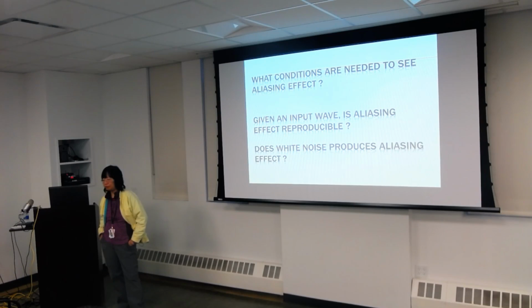In this case, the constant noise you're talking about is in real space, so you can subtract that in real space. But if any aliasing happens in Fourier space, it's still going to be there. You can't subtract that if it happens. But from what I understand, aliasing is essentially what happens when you do the transformation and your mathematical function doesn't describe your real data well enough, right? If the white noise is already subtracted off your real data, it's not part of your real data anymore, so that shouldn't be part of the problem. That's true. Yeah.